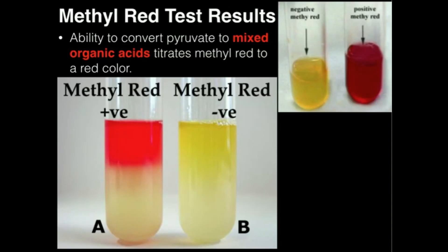Let's take a look at the specific results for the methyl red test. Fairly straightforward — if it's yellow like this, that is a negative methyl red test, meaning these bacteria do not have the ability to convert pyruvate to mixed organic acids. Over here, we clearly see this is red — same thing here, more diffuse, but the principle is the same. A red result means that these bacteria do have the ability to convert pyruvate into mixed organic acids.